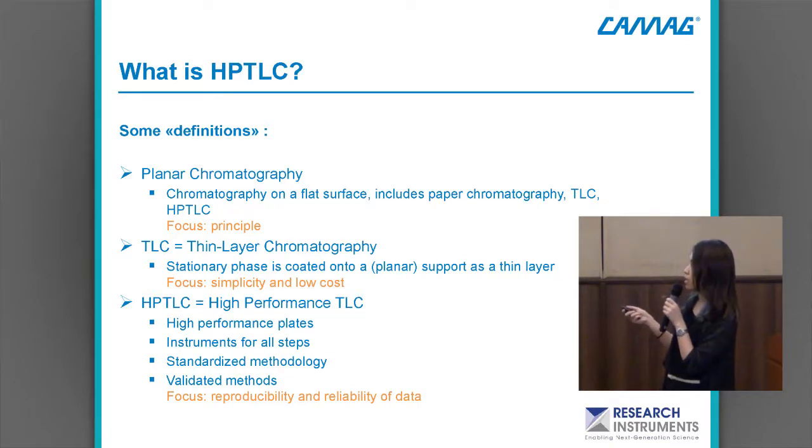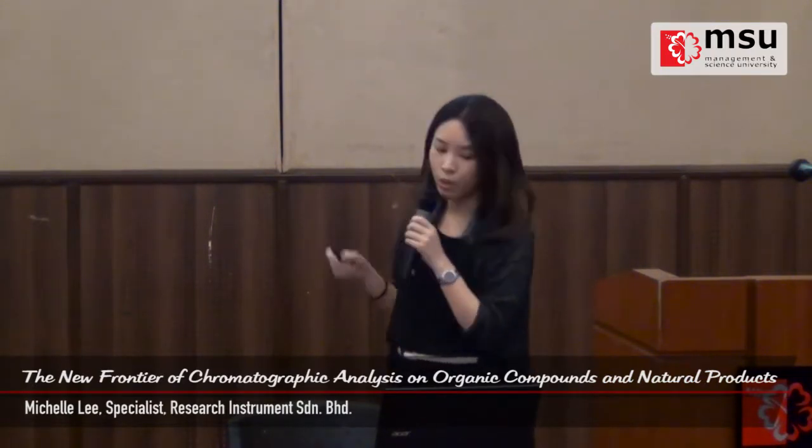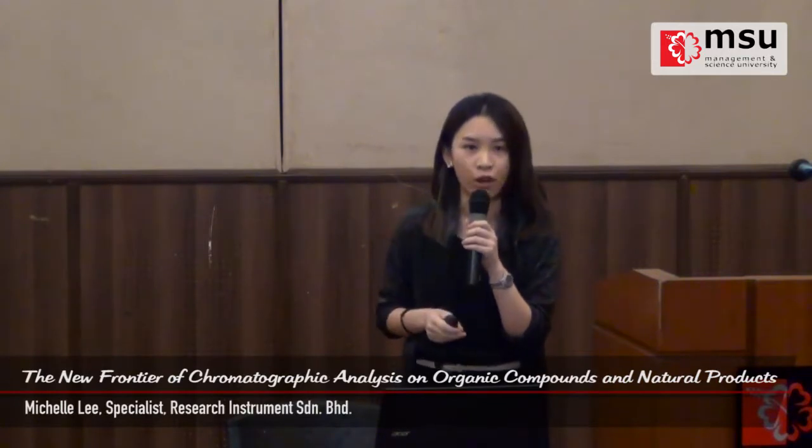So of course, using the instrumentations, the methodology, you can actually standardize it, and as well you can actually validate the method. But on the manual TLC, of course, you couldn't do that. So the next thing is, what is chromatography all about?